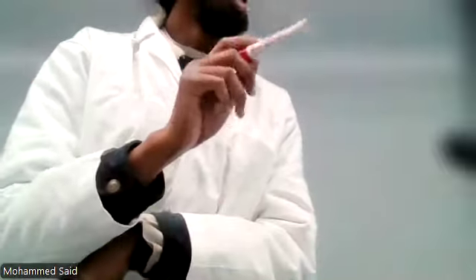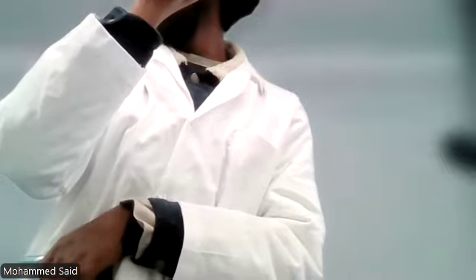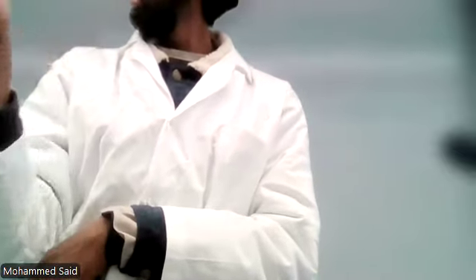Let me just see if there's anything else. Any questions in the meantime? If your group is done, by the way, for the time points, you can place them on the top left side for incubation. Remember, you flamed the flask. Just remember aseptic technique.